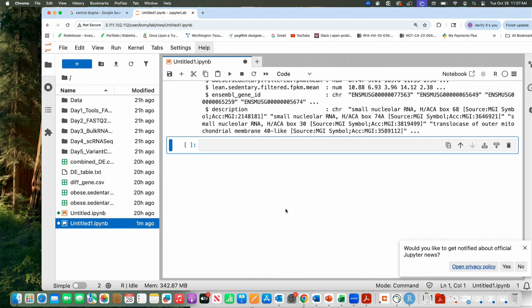As I mentioned, remember white spaces? What I said yesterday: never use them, they're redundant pretty much. Between a command and the parentheses, never white spaces. When you write a string, you never use white spaces normally. If you have two words, you always connect them with an underscore. That is the best convention.